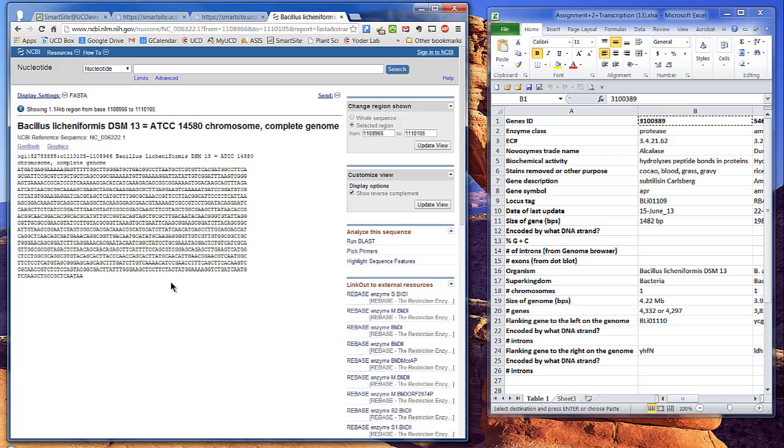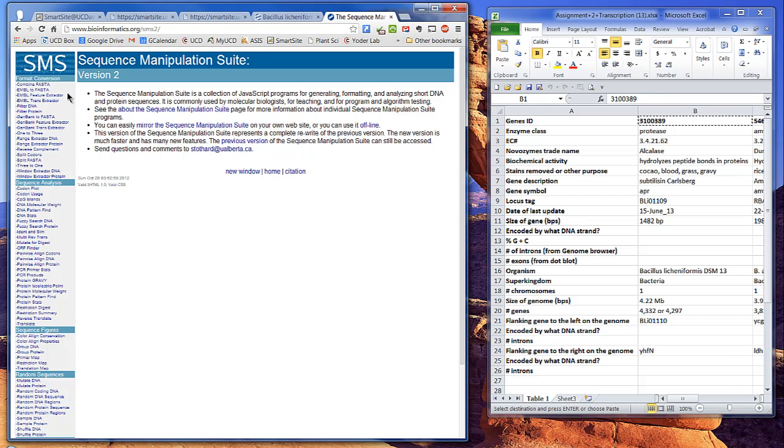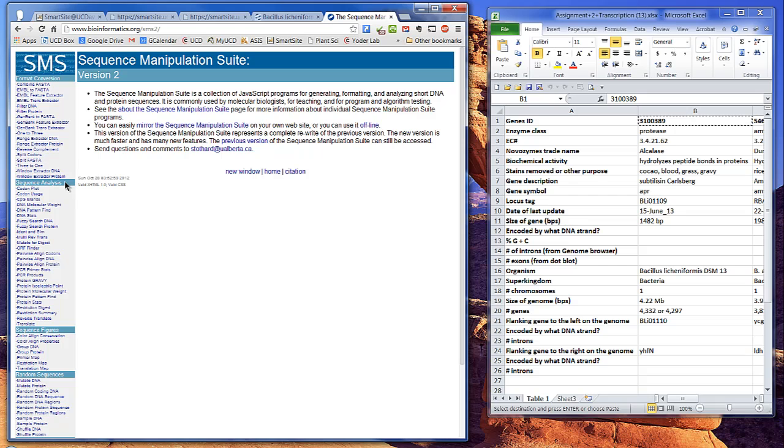The Sequence Manipulation Suite is a collection of JavaScript programs for analyzing short DNA and protein sequences. At the top, you'll see lots of conversion utilities, for example, being able to translate a GenBank sequence into a FASTA. We're going to use the sequence analysis programs, and in particular for this exercise, we're going to use DNA stats.